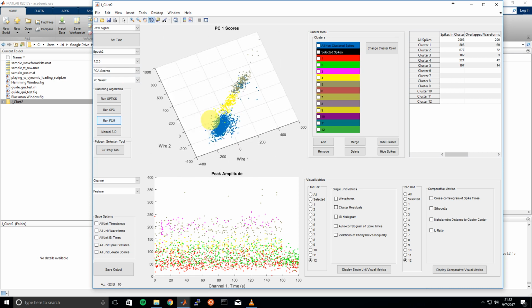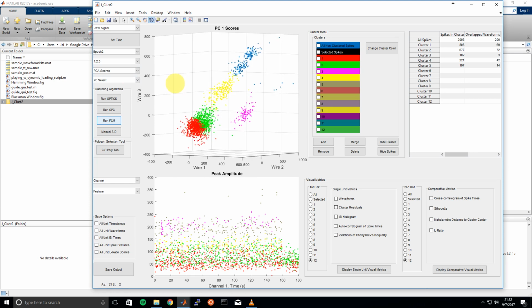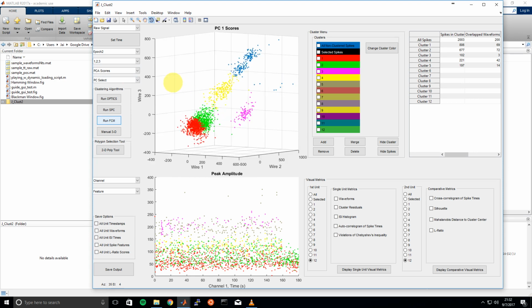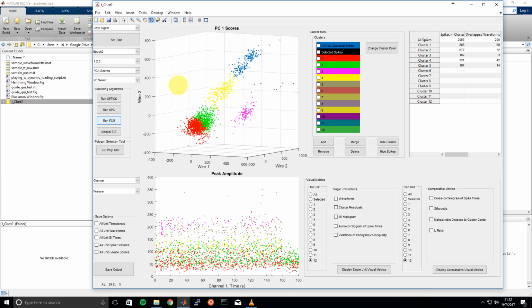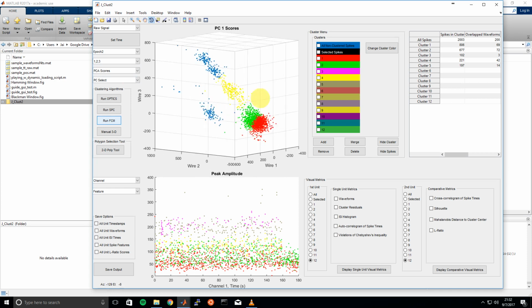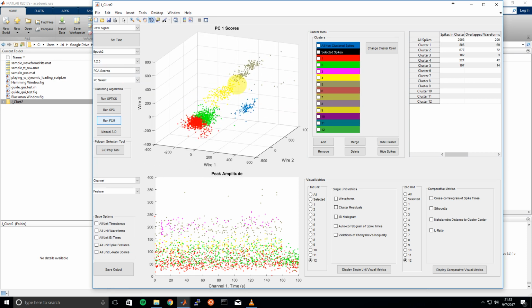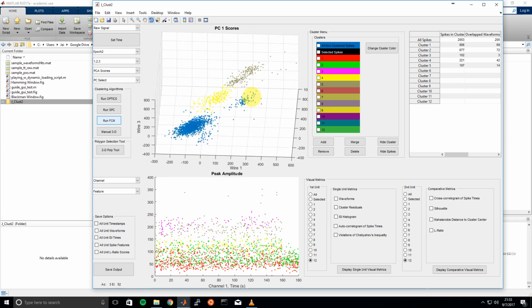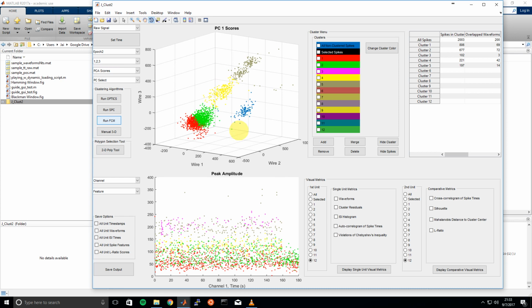Also, another thing to note here is that sometimes in MATLAB's 3D space, the way the plot function works is that if you're plotting multiple colors, you don't always see multiple colors at once when viewing them in a 3D space. I don't know the reason for this. You always do see them if you're viewing them in a 2D feature space. So we'll go back to one of the channel combinations. It's just a 2D, and we'll start editing our clusters here.